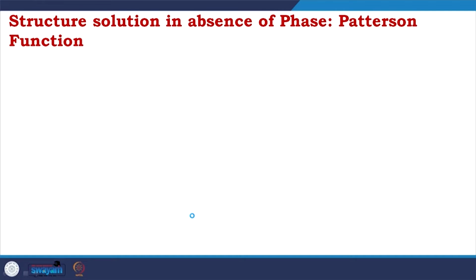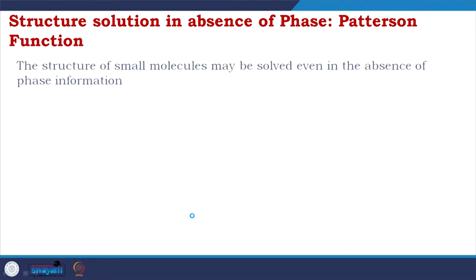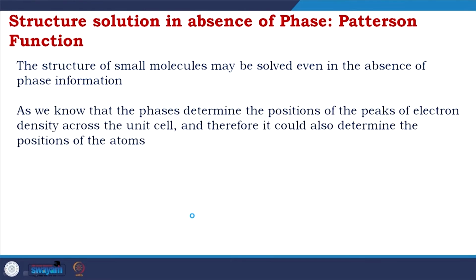Structure solution in absence of phase: the Patterson function. The structure of small molecules may be solved even in the absence of phase information. As we know, the phases determine the positions of the peaks of electron density across the unit cell, and therefore they also determine the position of the atoms, right.